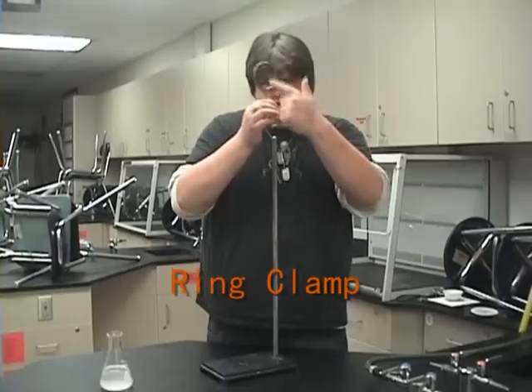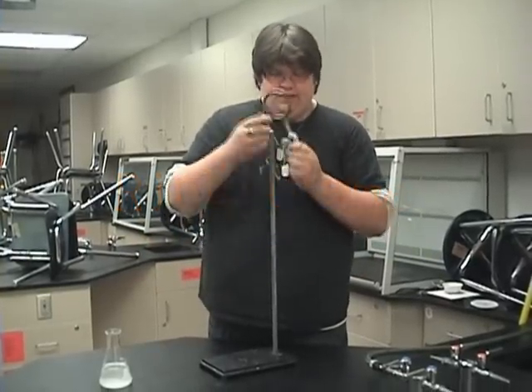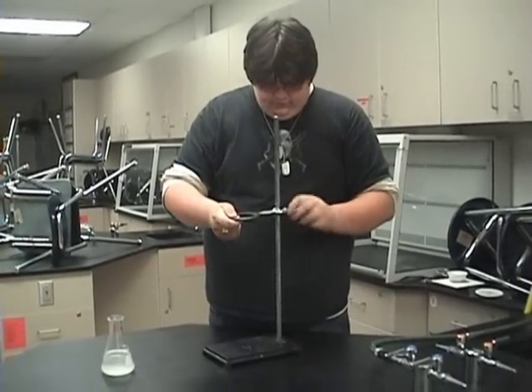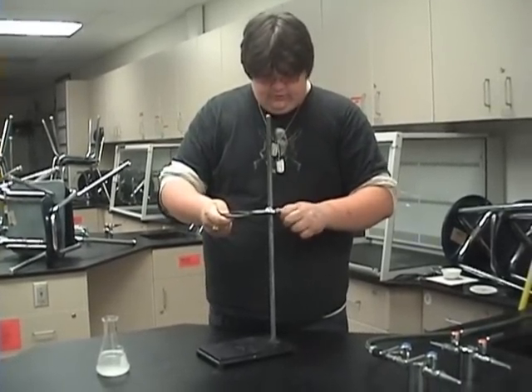This is called the ring clamp. It's a ring and a clamp. You put this in the clamp and you put it up and screw it.